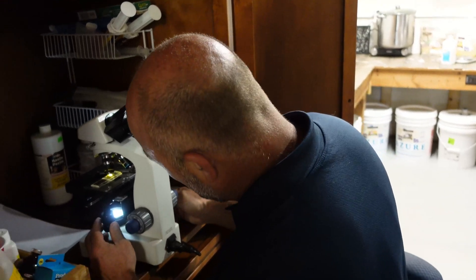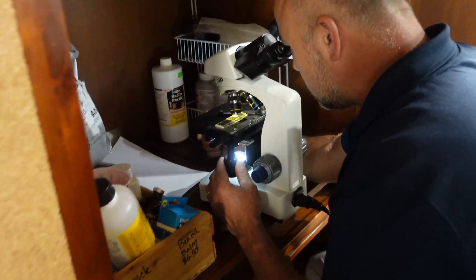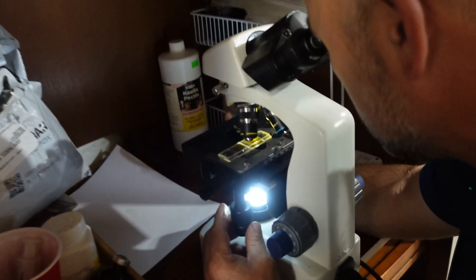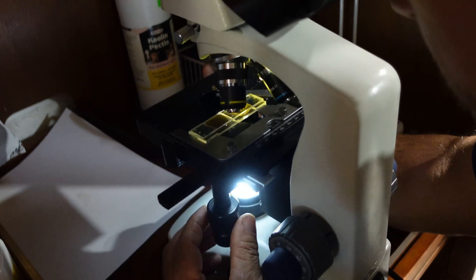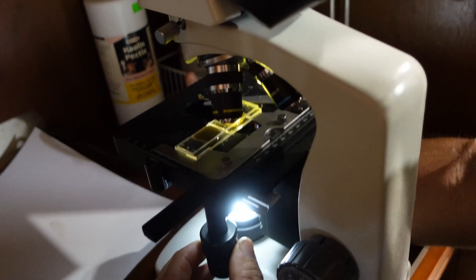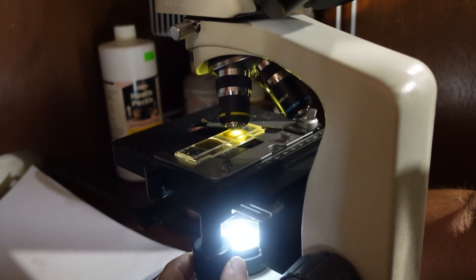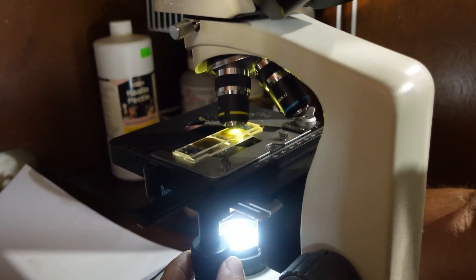With this microscope, I set it on 4x magnification and focus in. There'll be some little tiny air bubbles, and if I can focus in on those, that's generally about the level where the eggs will be too. So I'm just going to go up and down and count the eggs.